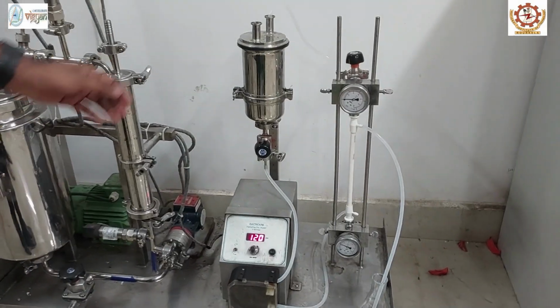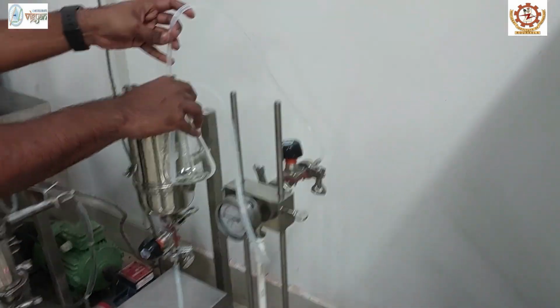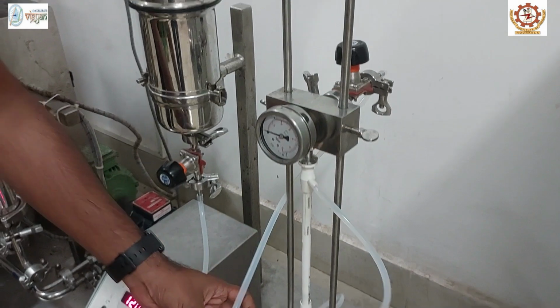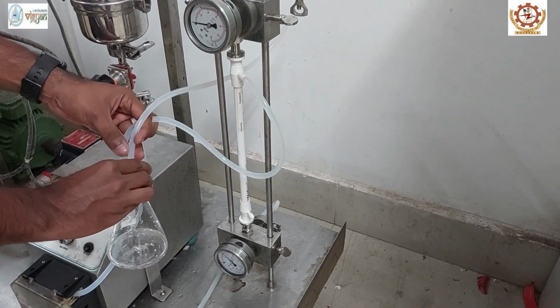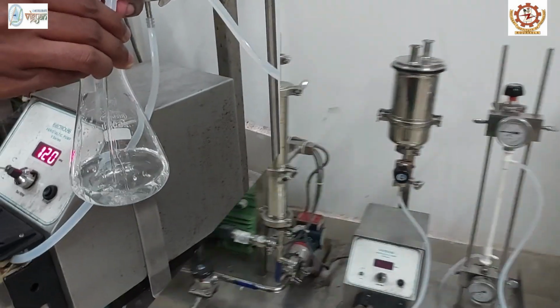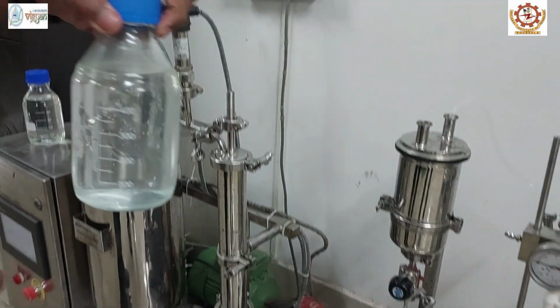Once the water wash is done, we will remove water from the feed tank like this. The water will be collected in this conical flask. You can see. Once the water wash is over, we will do alkali wash.